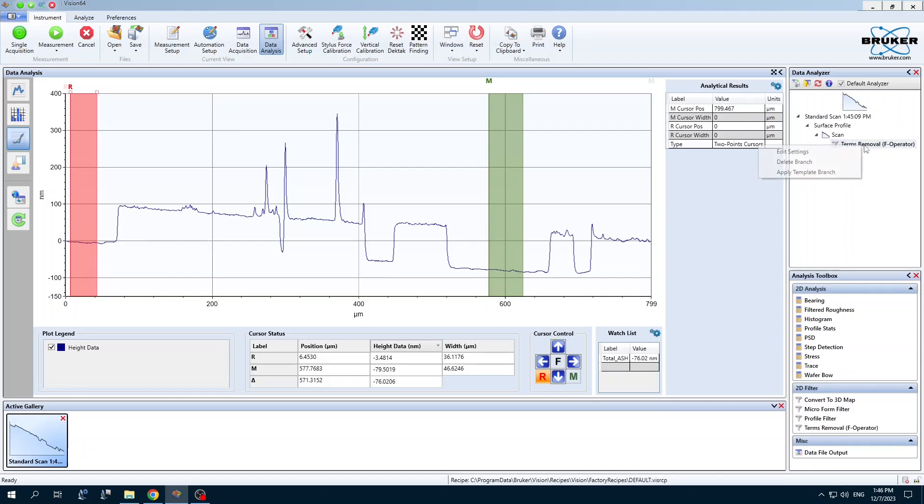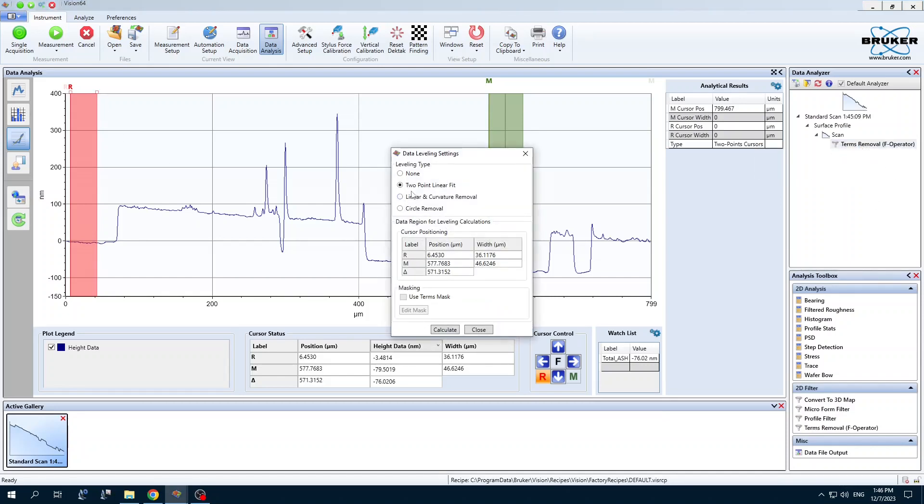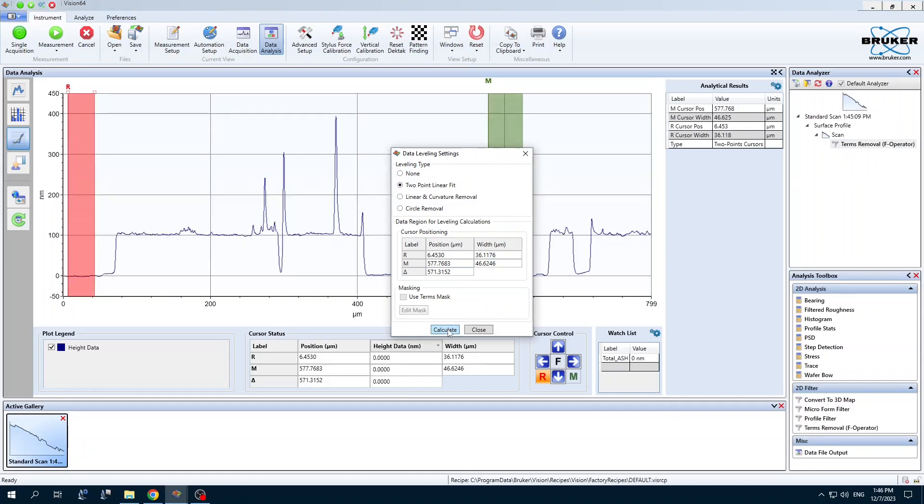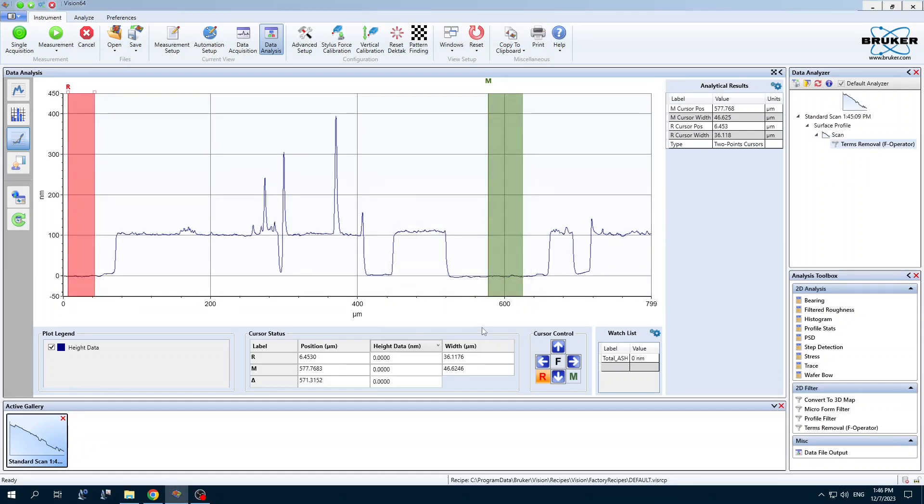I just want to set this M value over a flat region and R value over a flat region. I'm going to right click on this terms removal, edit settings, two point linear fit, calculate. Now we have a new baseline with our base zero and our features.